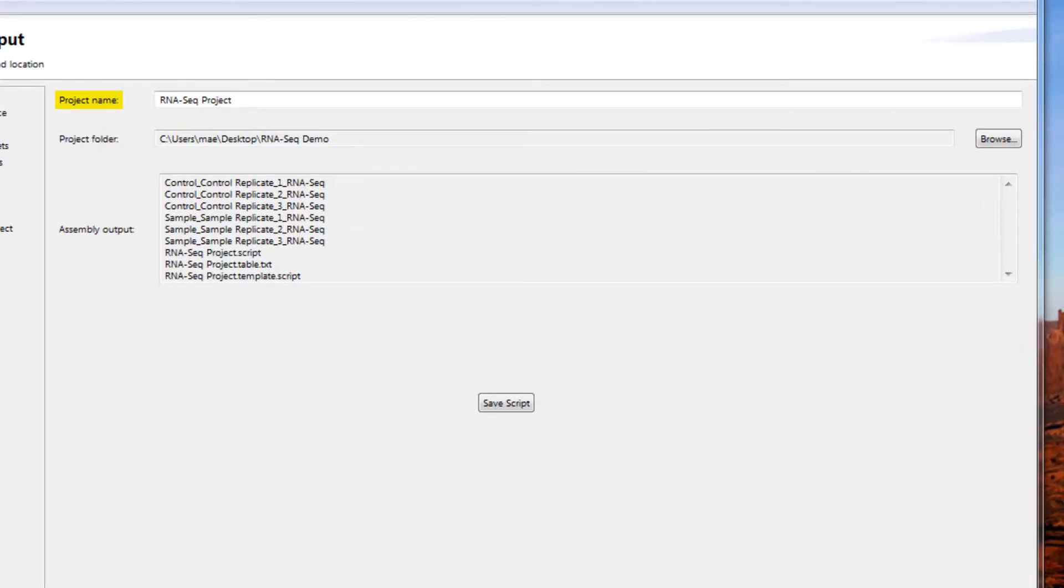The project name and folder for saving the output files can be specified in this next page.